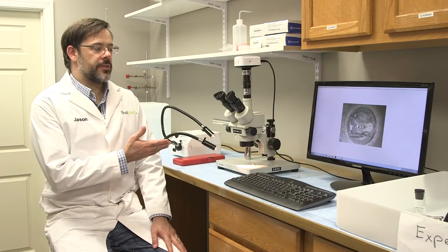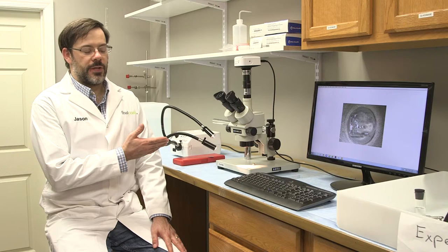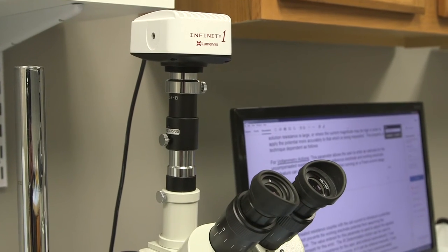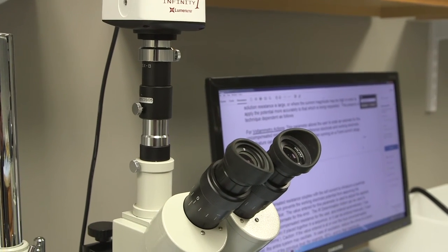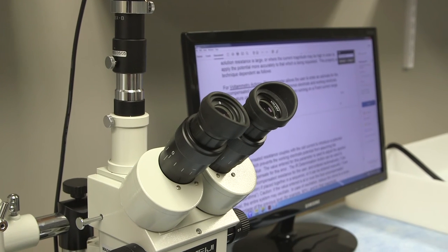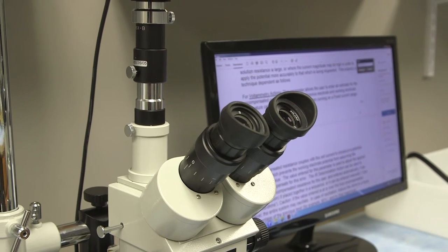As you can see here, we have a microscope that's used for the visual examination, and it's fitted with a CCD camera which is attached to the computer, so we can make computer documentation of each sample.